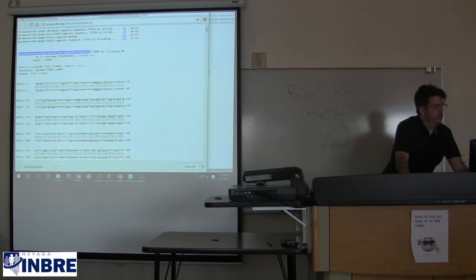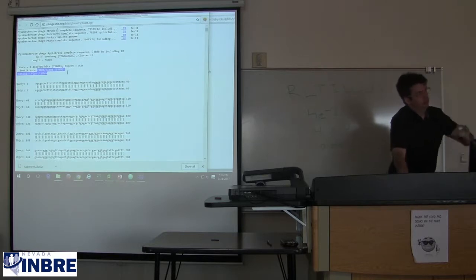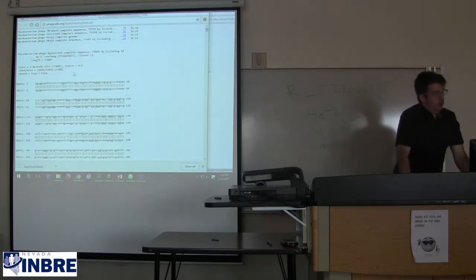The number of identities is 73,808 out of 73,808, 100% identity in the same alignment, plus strand to plus strand. Plus is the sequence as we fed it in, as in AGC. Minus would be the reverse complement of that, the opposite strand. We don't want to be scrolling forever because this will show us all 73,000 lines.